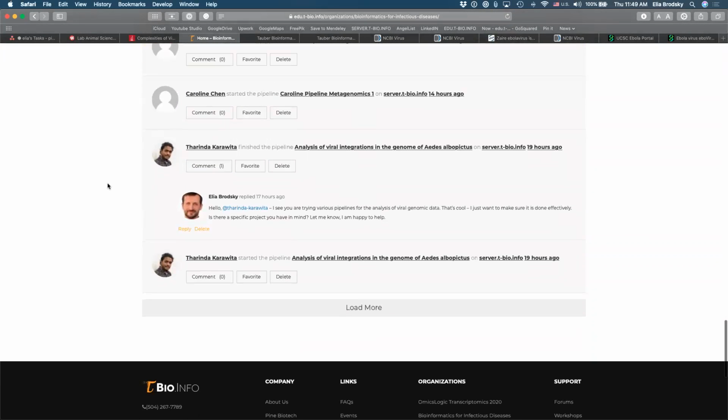So, try it. And I think everybody learns by trying. And again, this recording, I think, will be a good guide to just repeat the steps. But in the future, right, when you're ready to work on a project from beginning to the end, we'll have the projects available for Ebola and for coronavirus and for SF9. So take a look at those as well.